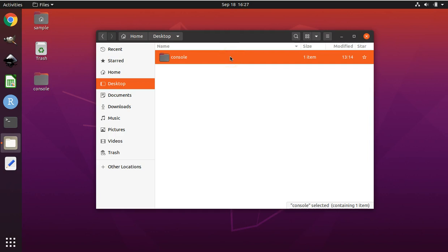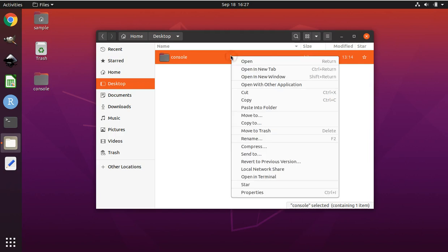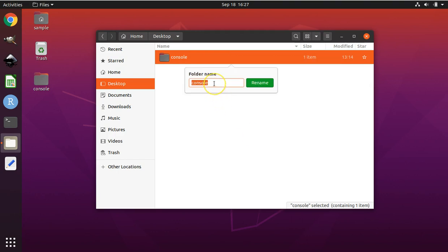And let's rename this folder to something more meaningful so that we'll remember what it is. Right-click for a Windows machine, Windows type mouse, 2-finger push down on a Mac trackpad, scroll down to rename, and we'll call it Arabidopsis structure results. Push the green rename button.